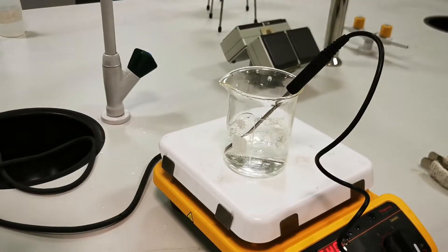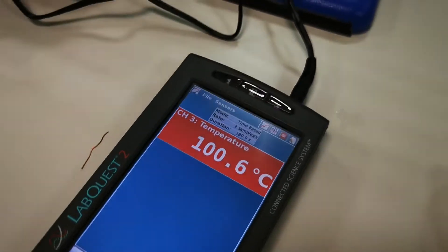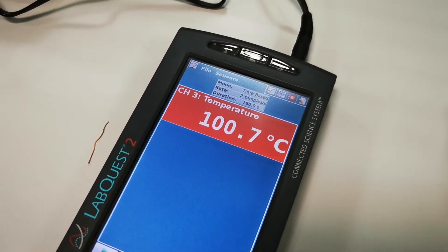Now, while waiting here, I'm checking the temperature of the water. You need to record this temperature, as well.